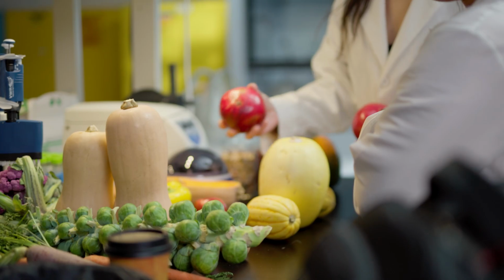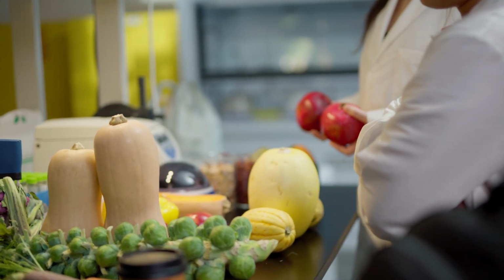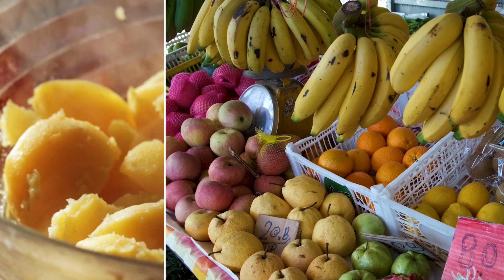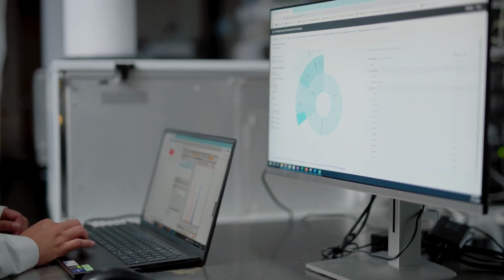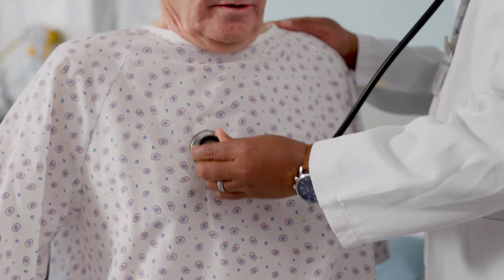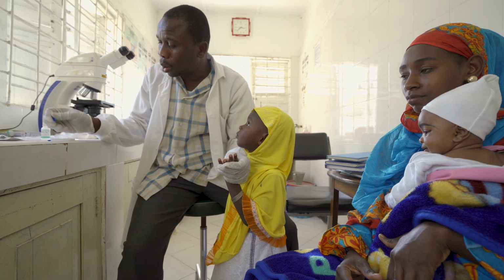The periodic table of foods, or PTFI, Glycomics method, is a first-of-its-kind method that allows us to not only understand what types of carbohydrates at a macro level, such as starch, sugars, and fibers, are found in different food products, but actually to be able to describe them on the molecular level. It's trying to understand what's actually in our foods, and by knowing that, that can help us further develop methods or understanding of metabolic diseases and also worldwide health.